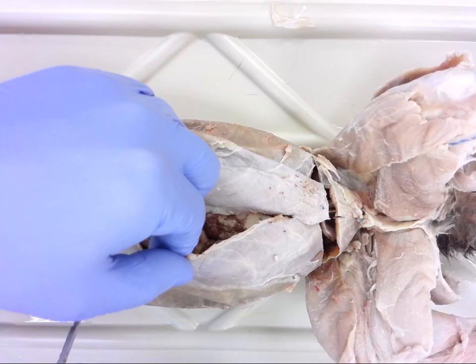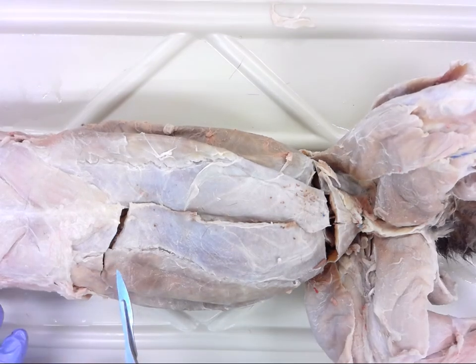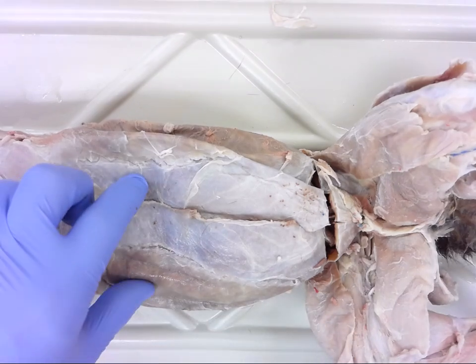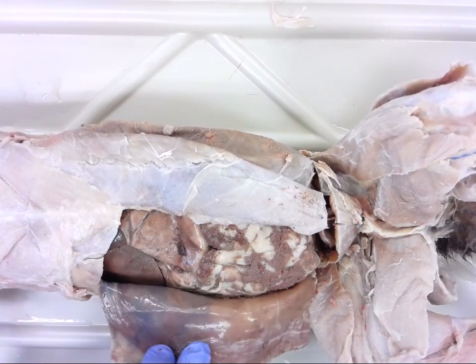Once we get into this, this is an area where some of these blood vessels can rupture. And you may actually see that in rupturing them, they do leak into the abdominal area. So you may see it's a brownish colored material. It's actually coagulated blood. So what I'm going to do is I'm just going to fold this back now.